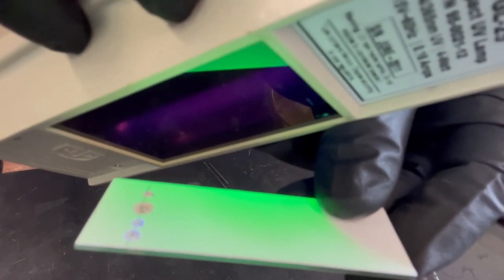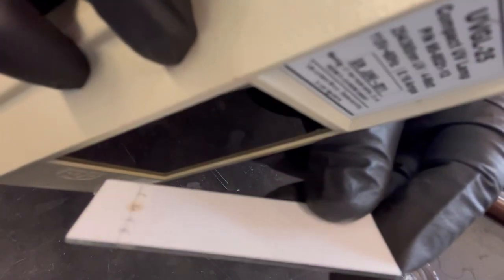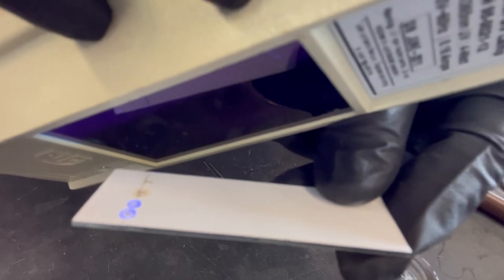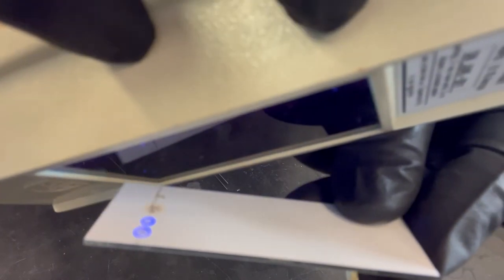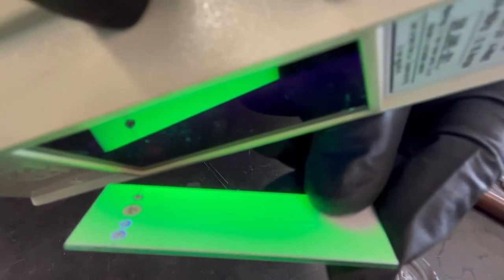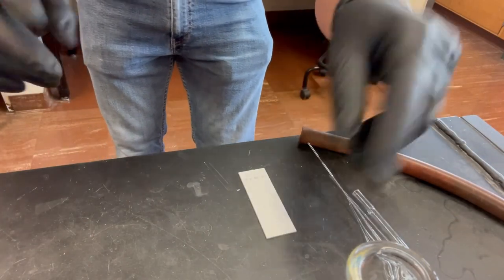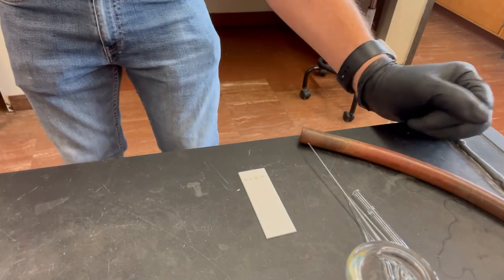What's interesting is that that's the short wave UV, and then this is the long wave. Oh, that was kind of cool. It just came off late. But notice the two filtrate samples don't really glow. So that's off, so any color you see is associated with just the filtrate itself in the visible spectrum. This is on in the long wave. These two samples do glow, but the filtrate doesn't. But then in the short wave, they all glow. It's just different wavelengths or whatever, so no big deal.